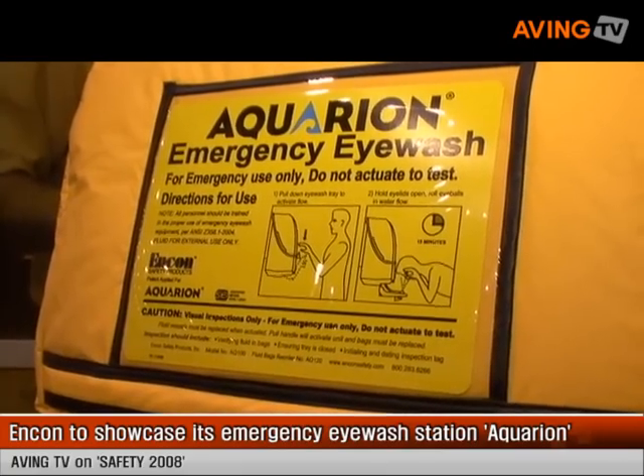Hi, my name is Jeff Felker. I'm with Encon Safety Products. I'm the National Sales Manager. We are here at ASSE Show and our featured product would be our Heated Aquarian Unit.